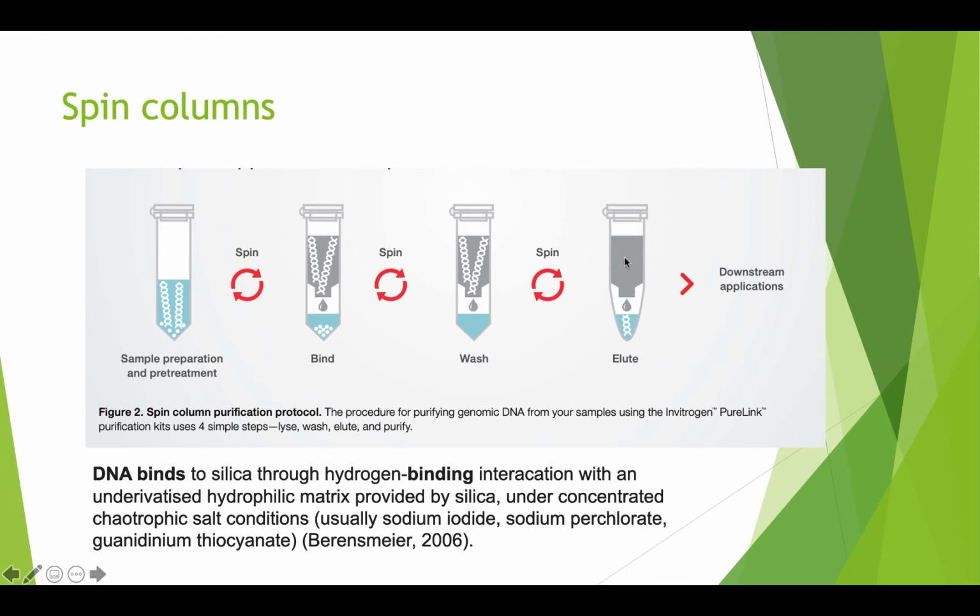Can you reuse the column? No, unless you are using it on the same patient, the same bacteria, the same strain. It might. Will it bind the same capacity? Might. But it will be contaminated with the older DNA, and it will have a lot of the cell contaminants here. So it's not really designed for that.